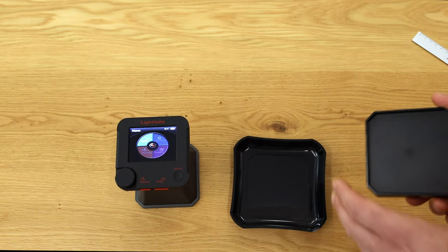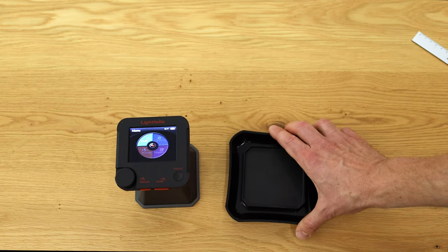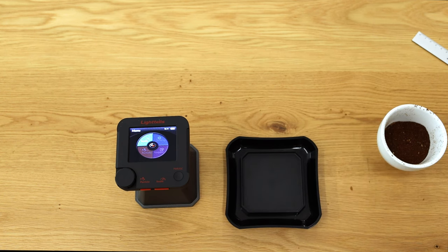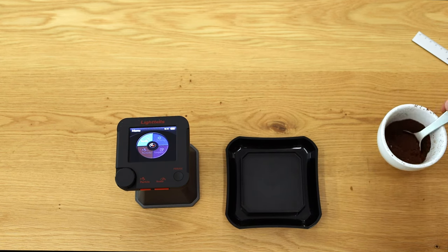Next I prepare a ground coffee sample, using the flatter side of the cup to avoid using too much coffee. An important note — as I also covered in my video for the Lighttells CM100 Plus — the grind size makes a big difference in the measured value. You must be super consistent with your grind size; only by using the same grind size every time can you get values that are truly comparable.